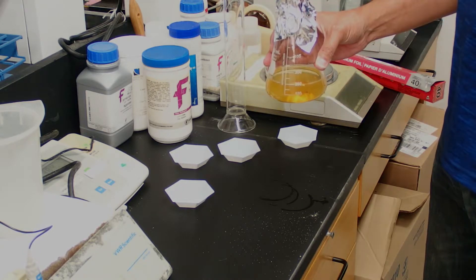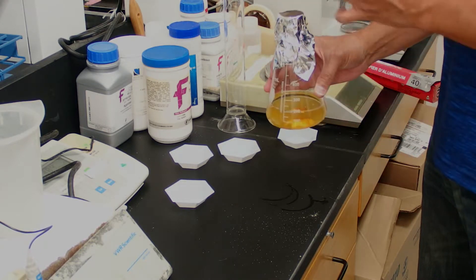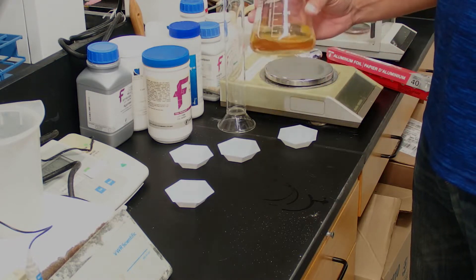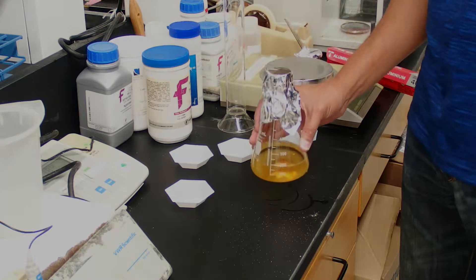We'll cover it in a 500 milliliter Erlenmeyer flask so that it doesn't boil out of the flask in the autoclaving process. Now we'll take this down to autoclave and sterilize it.